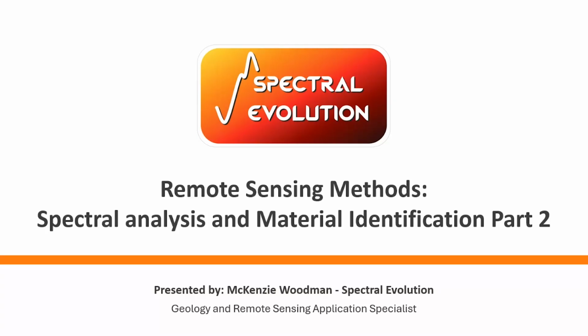So this is part 2 of a 2-part series, and I'm going to be talking about remote sensing methods, spectral analysis, and material identification. And today is going to be particularly focused on using the EZ-ID tool and all of the streamlined tools that you can use for data analysis, both in the field and in the lab. So thank you very much for coming today, and we'll get started.